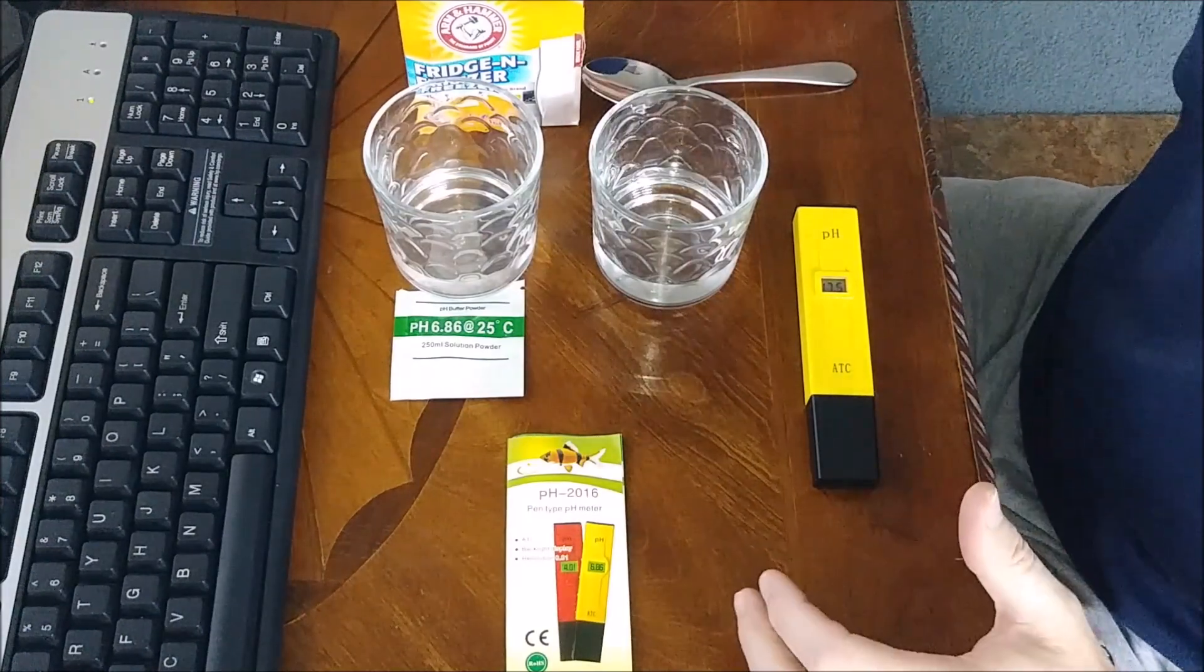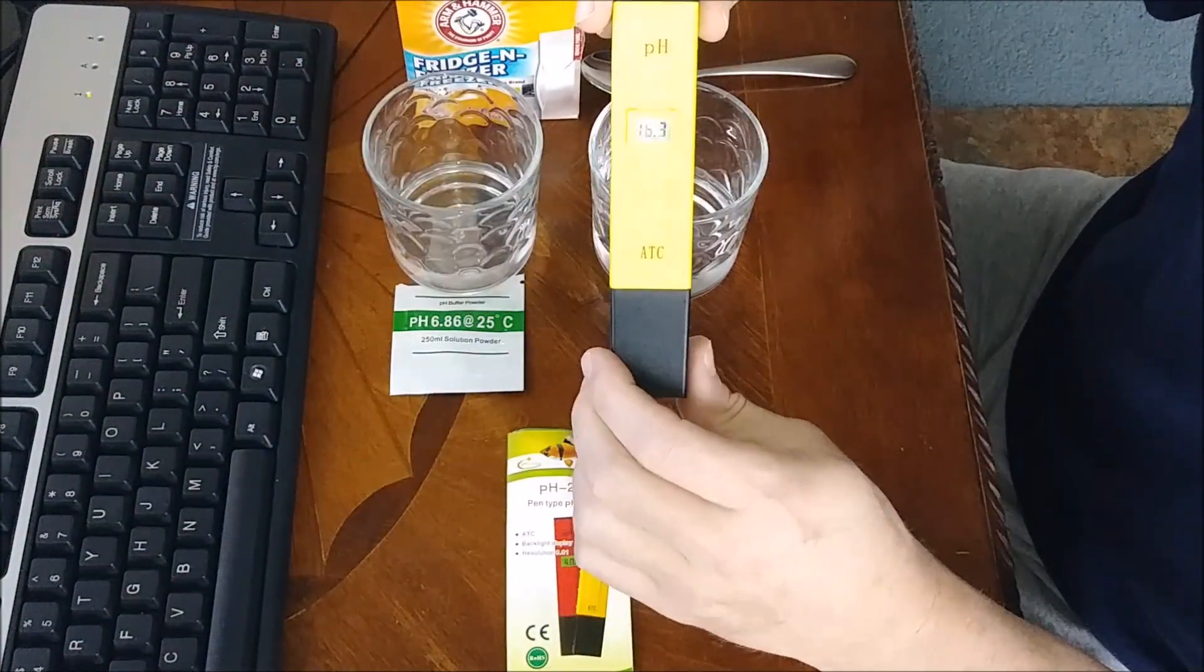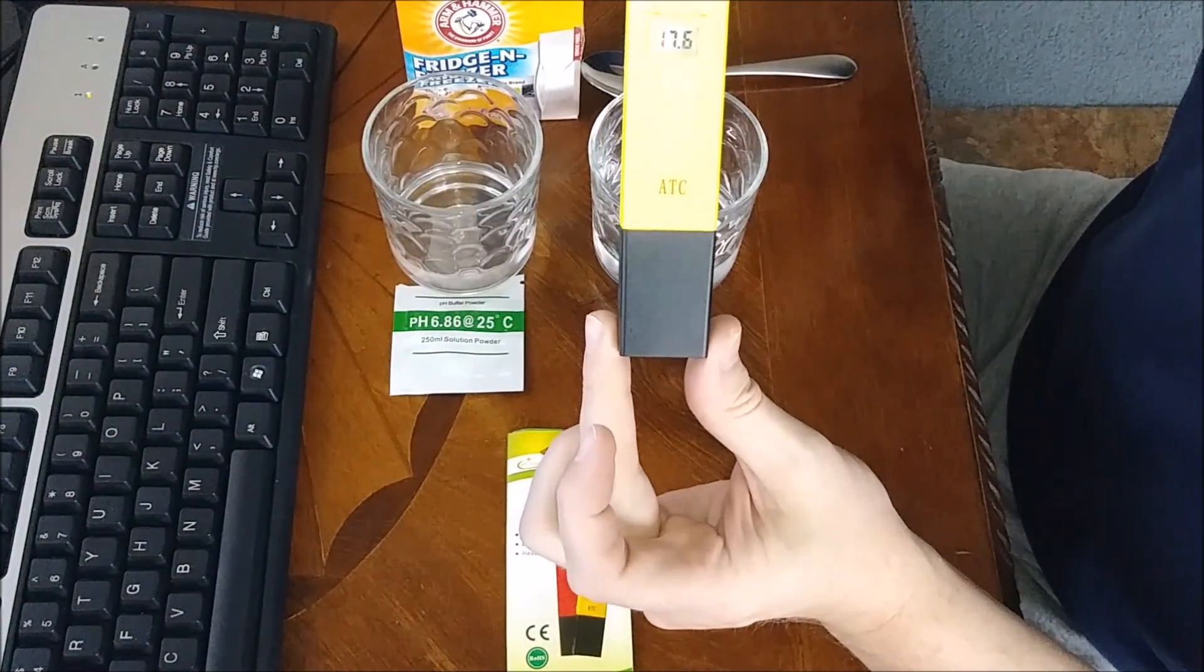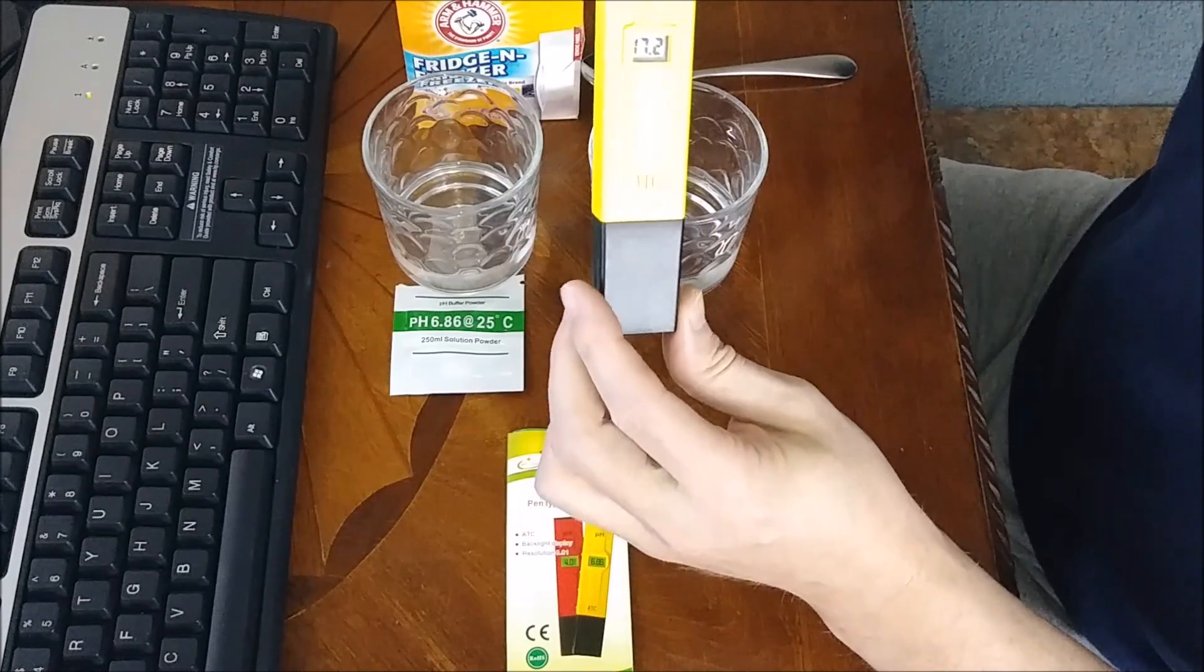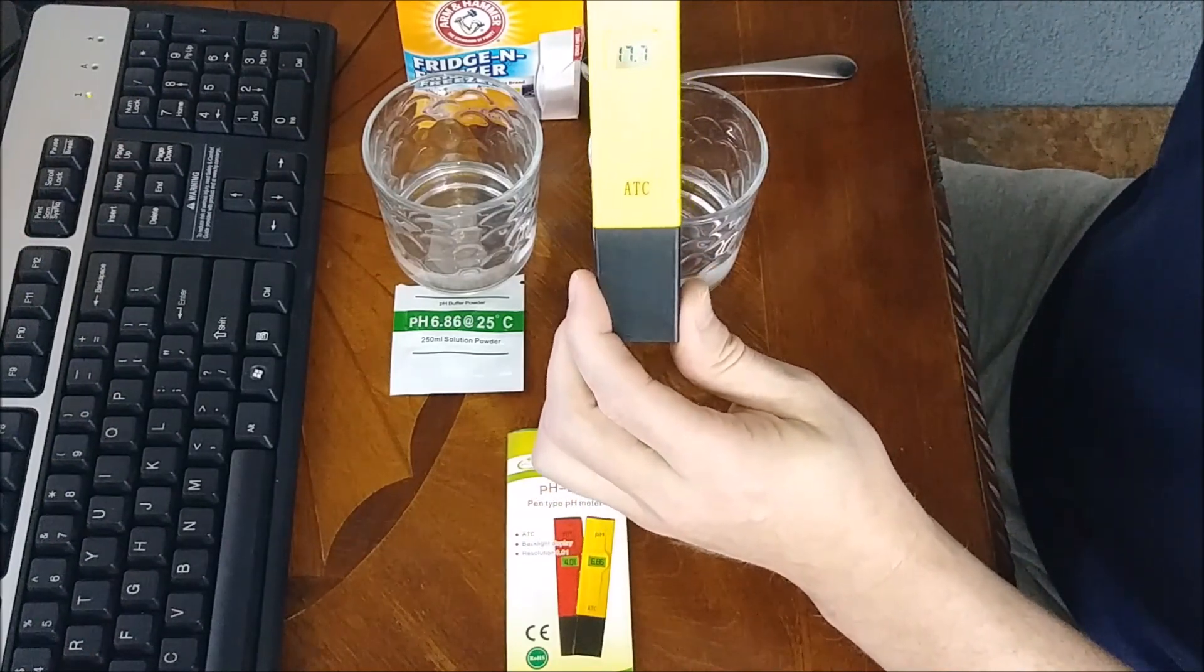Hey, this is Rick and welcome back to another unboxing review and how to set up your pH tester. I have the ATC pH tester. I pH my water for my aquarium and also for my plants.